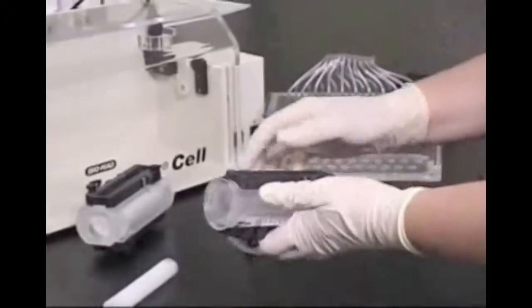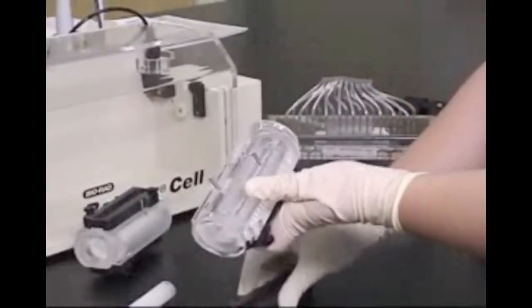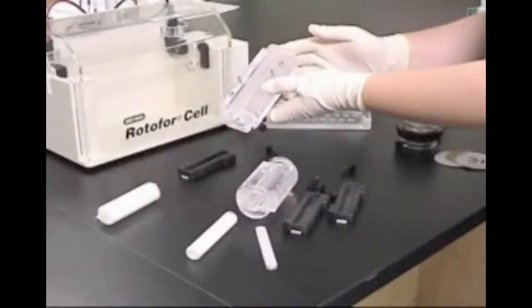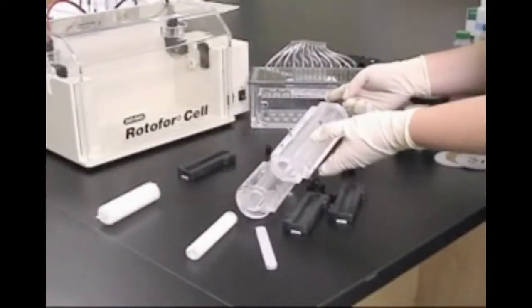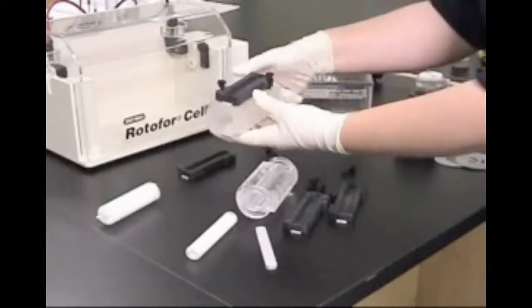The loading ports are located on the opposite side of the focusing chamber. In the mini-focusing chamber, these loading ports lay within a groove that is sealed with an additional rectangular gasket.